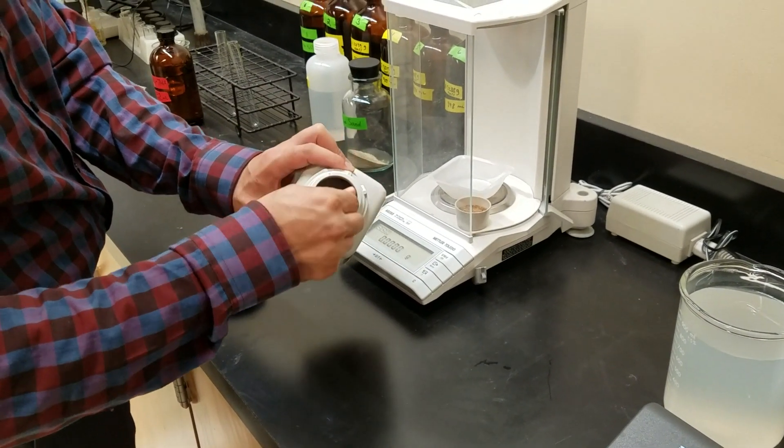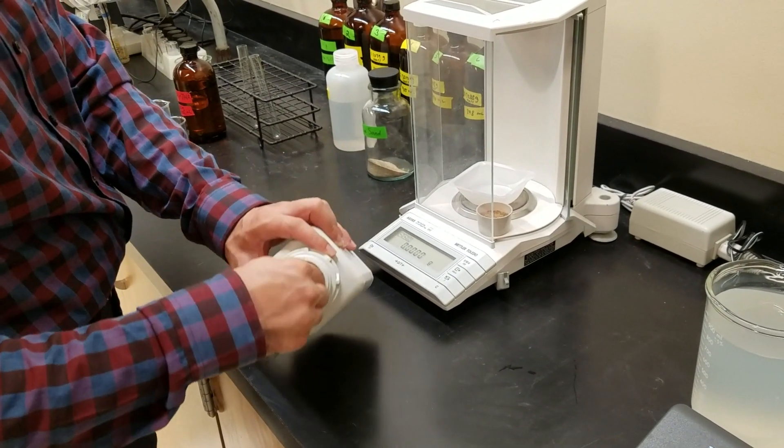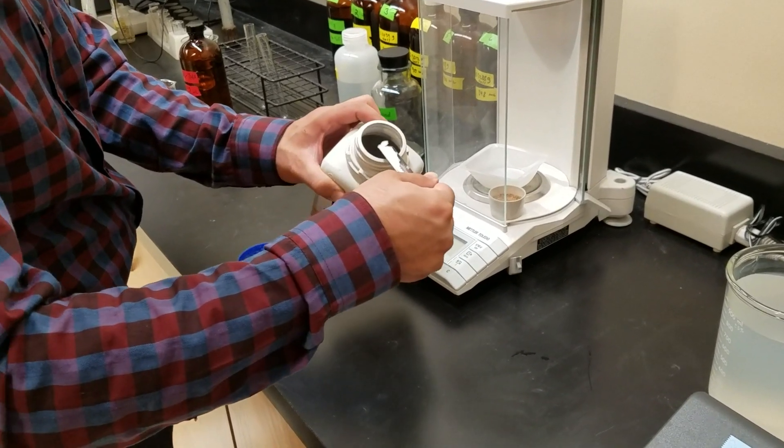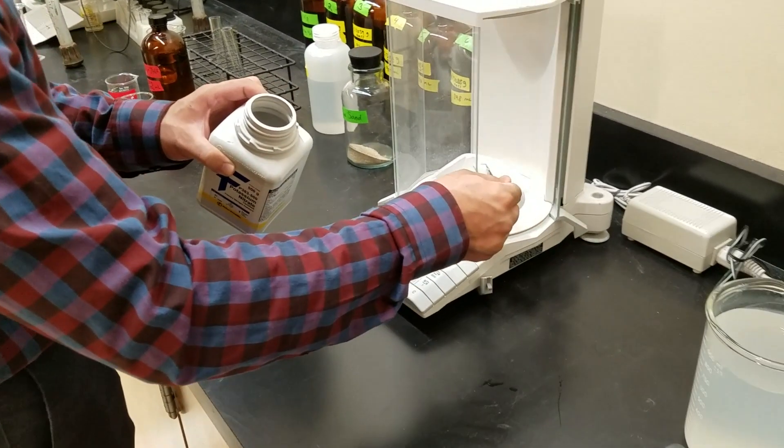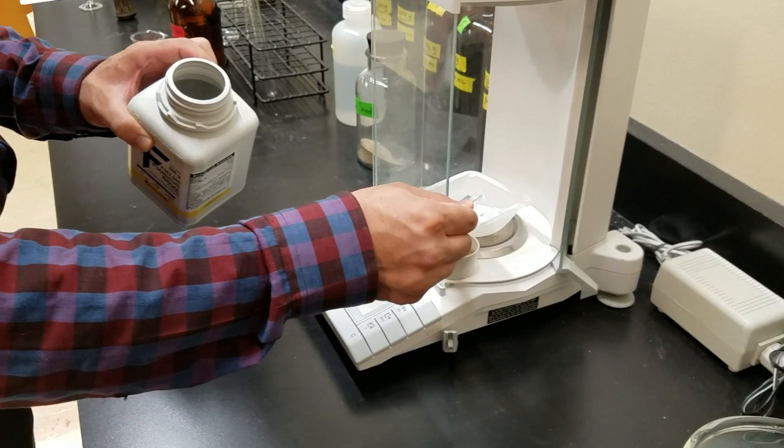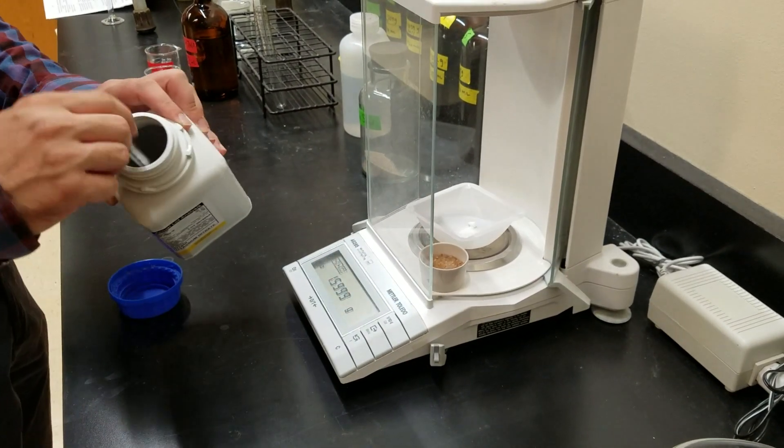To begin with we measure out some potassium nitrate on an analytical balance and of course we'll write this in our notebooks. The lab will suggest what weight of potassium nitrate to use.